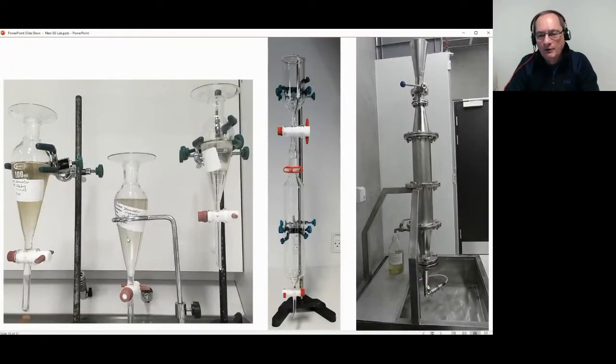This is an example of such sedimentation. On the left, you see the post sedimentation, the post fractionation we are doing, where we want to get rid of the last bits of clay and so on in the samples. So we leave them there for a day or 2 days, and then they'll settle, and then we collect the floating materials, and then we analyze them.